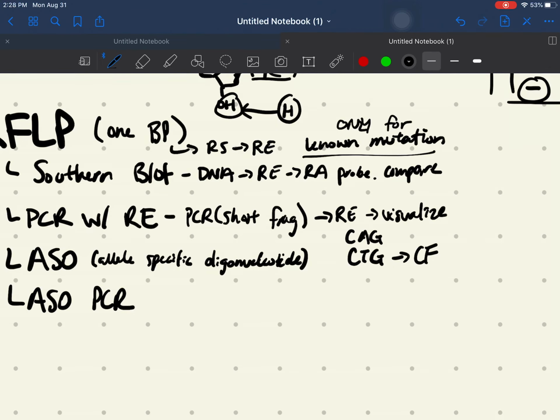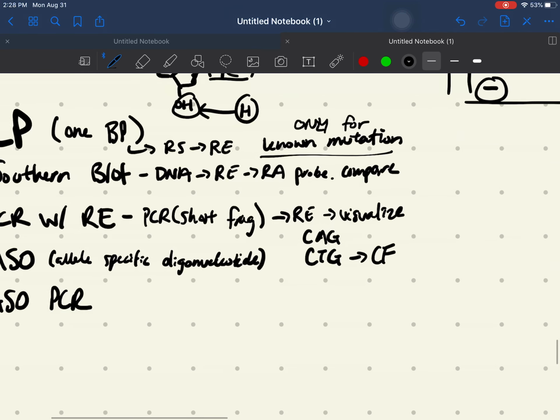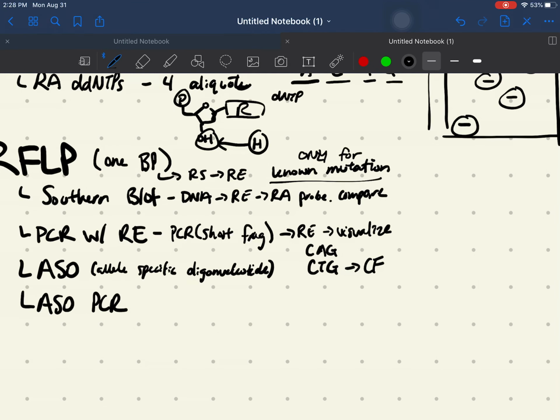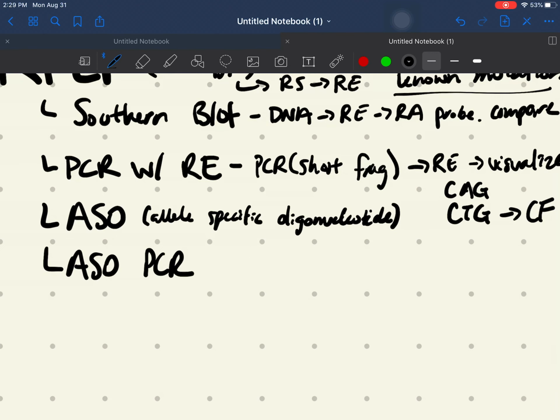If that results in cystic fibrosis, then you can use your allele-specific oligonucleotide to test for these sequences. And essentially, you don't have to do anything, okay? So essentially, all you got to do is just take the DNA, denature it, add in the probe, and if you see a speck, if you see anything, you have the disease for that probe, okay?